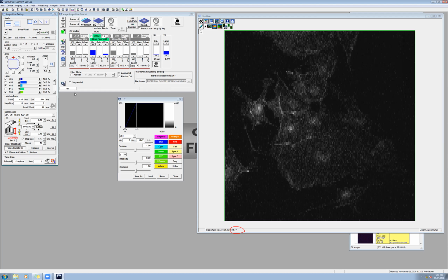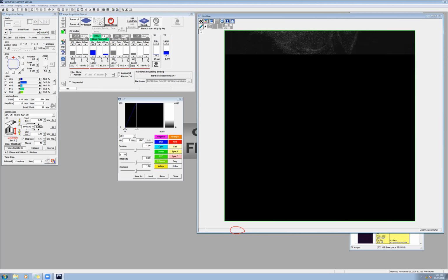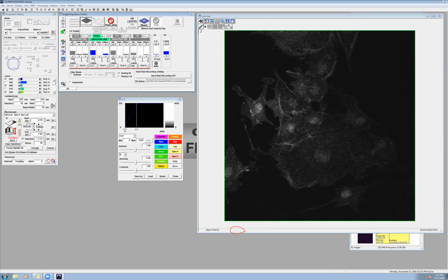So when we play with this area, right now the signal looks very terrible. What if I go to focus times 2? It looks a little better. What if I do XY repeat? It looks kind of better, but not a whole lot better. So one thing I'll do now is try to adjust my fine focus. Okay. So on this microscope, you can adjust coarse and fine focus on one dial itself. So I can change this to coarse and fine from here.